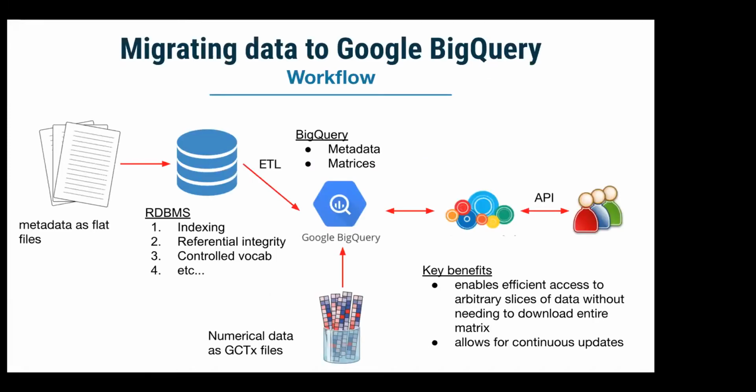So it's a lot of data, so we needed to think about how to make this data accessible. For those people who have worked with our data before, you'll be familiar with the GCTX file format, which has been very useful. That's been our workhorse file format, and I think it continues to be very useful for us. But in order to work with a data set of this size, we thought we needed something that's a bit more scalable. And so we've been working on migrating our data to Google BigQuery.